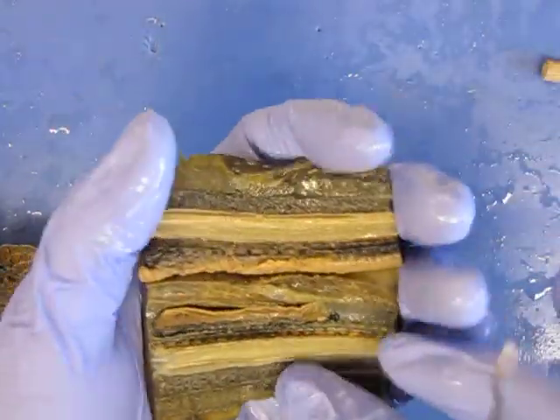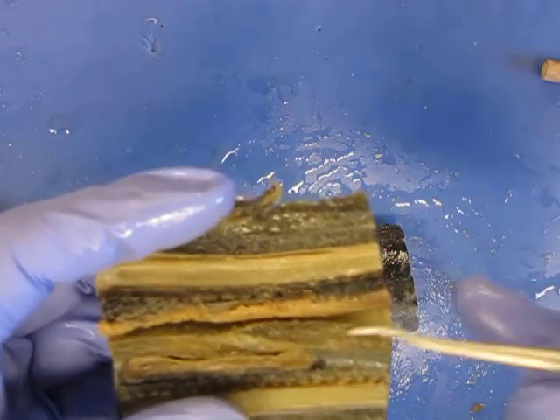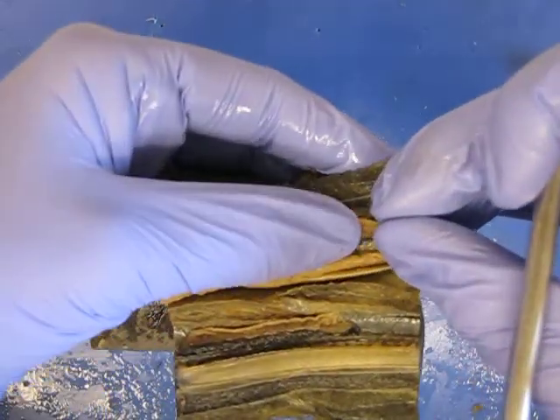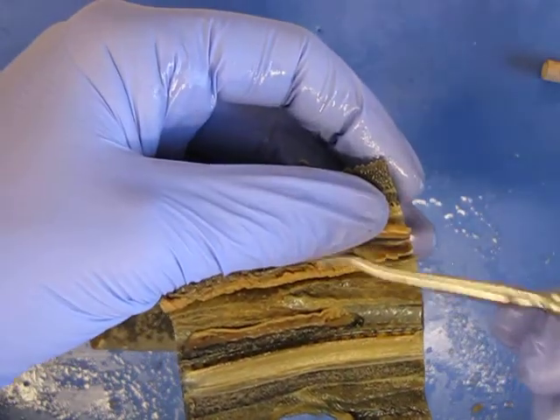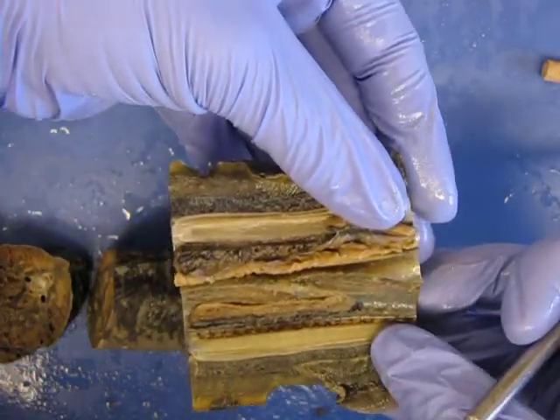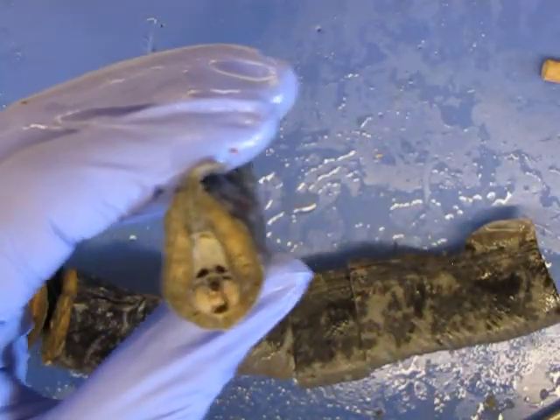This one I did another section to be able to see the testes again. So this is kidney. See, it's a flap. That's clearly kidney. And it's got that dark line along it there. And this is the testicular tissue. So had you done the sagittal section on a male, that's what it would have looked like. Okay, so now we've got kidney.